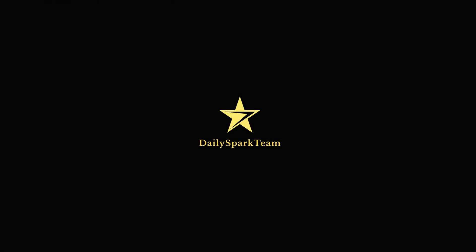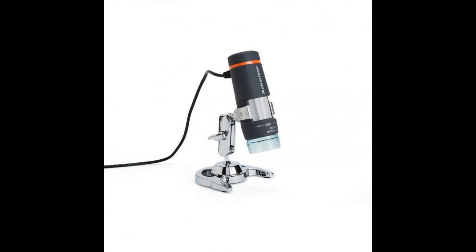Hello and welcome! Let's take a closer look at the Celestron 2 megapixels USB microscope. I've had it for a while now, so it's time to review it.